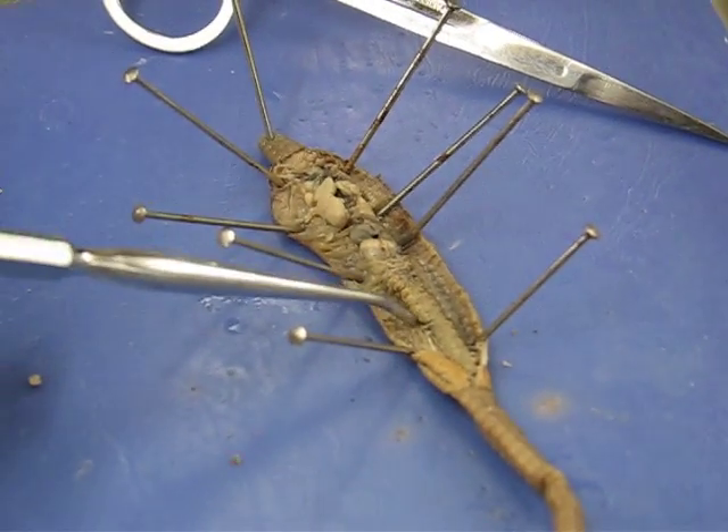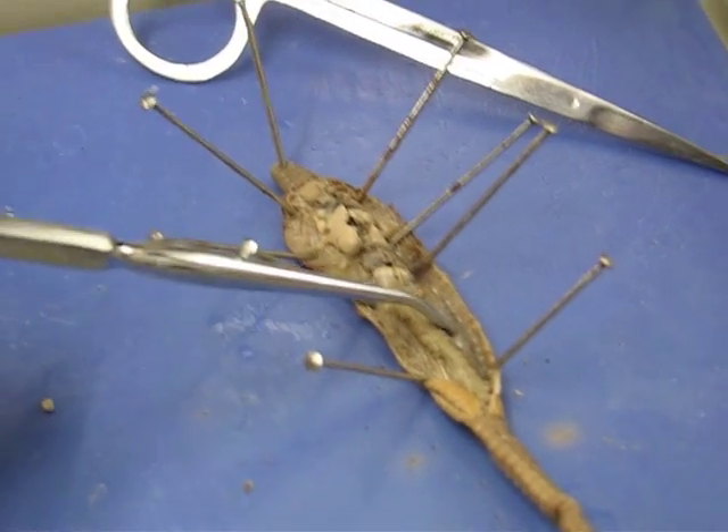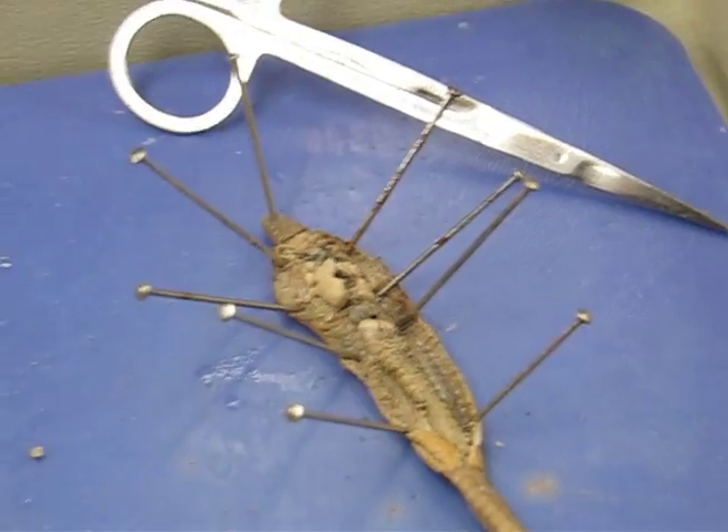The dorsal blood vessel on yours looks like it got damaged when you pulled it up, probably right down there. That's probably part of it there but it got pulled off. You can see it on there pretty good.